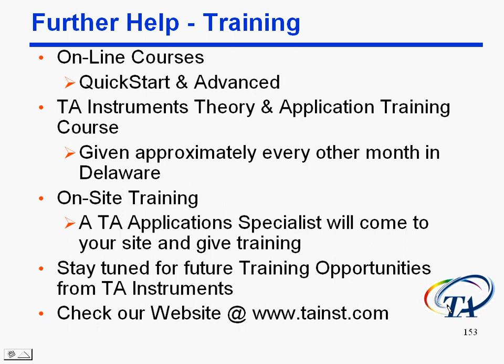Now for on-site training, you can have a TA Instruments application specialist come to your lab and give you training on your instruments. Now this can be configured any way you want it. It could be all day of a lecture, sitting in a classroom. I've done that for like 35 or 40 people. It could be part lecture and part hands-on, or it could be just all day hands-on. I've done any of those combinations. It really depends on what the customer wants.